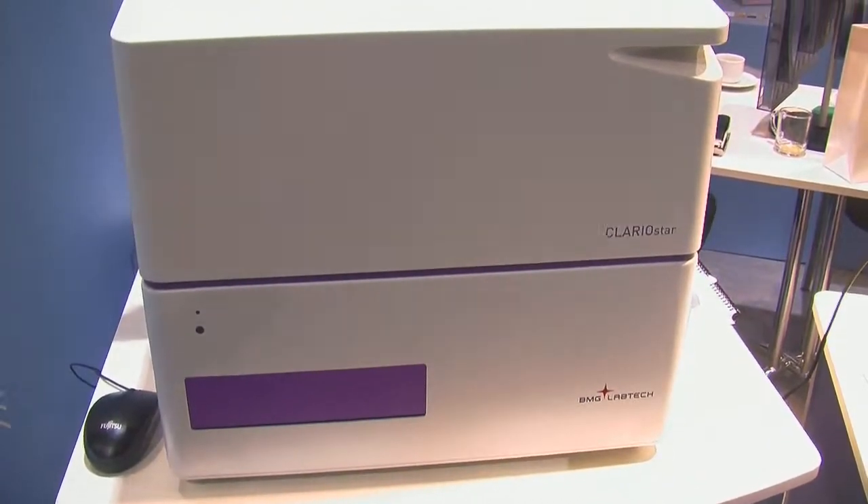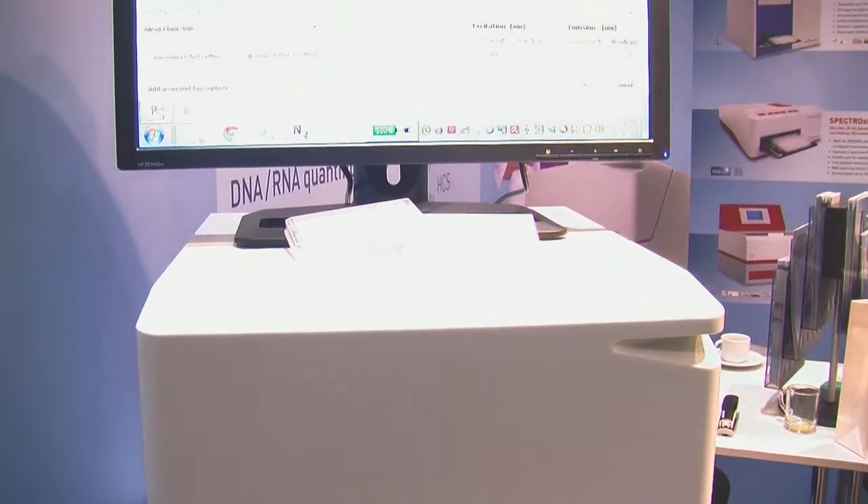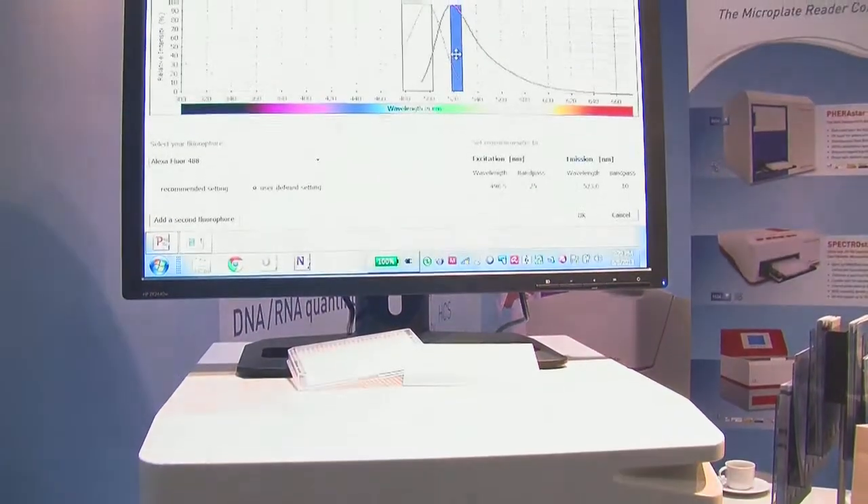This large bandwidth allows you to perform assays with this monochromator that can't be performed with other monochromators, such as far-red assays, fluorescent protein assays, and any specialized assays that require a broad bandwidth monochromator.